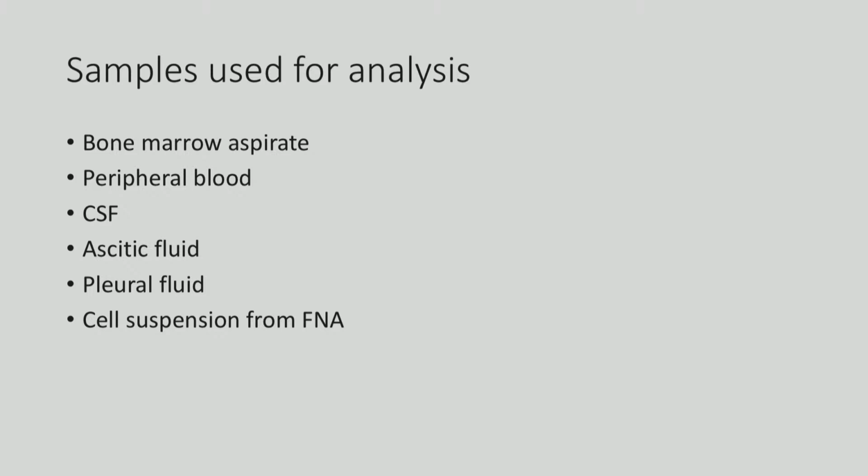When we want to diagnose acute leukemia and peripheral blood shows a high WBC count with lymphocytosis or abnormal cells, even the peripheral blood sample can be used. Cerebrospinal fluid also can be used for a diagnosis of hematolymphoid malignancies, provided cerebrospinal fluid has adequate cells, it can be another reliable sample for diagnostic purposes.